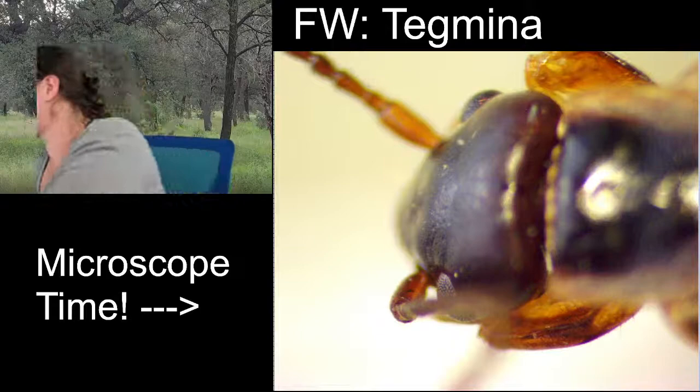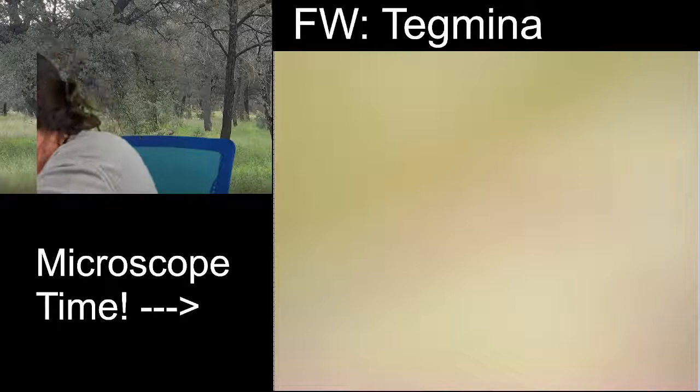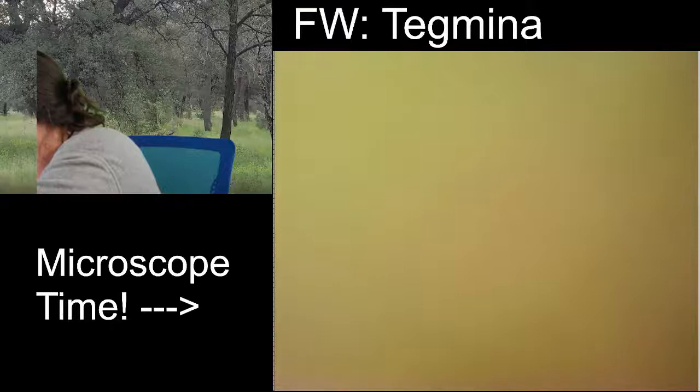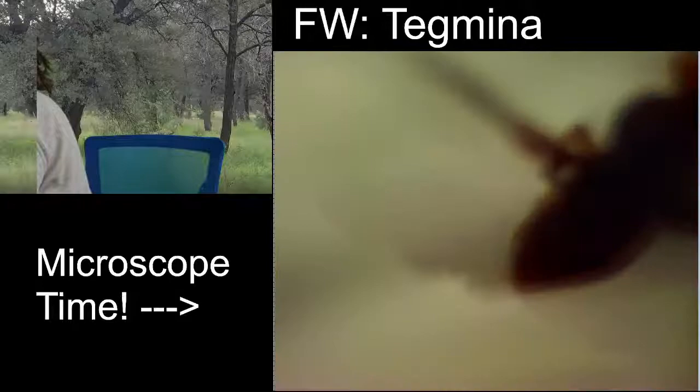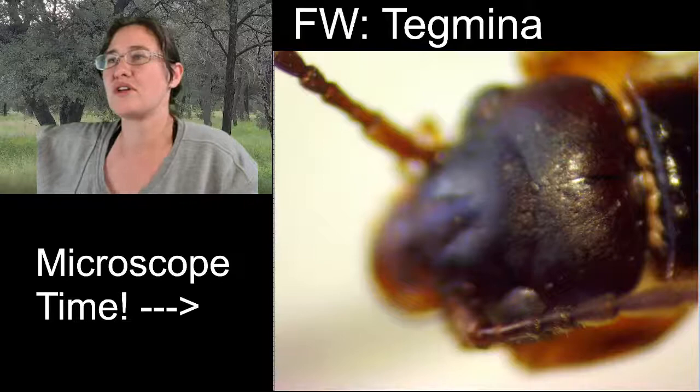Turn our earwig, or angle our earwig just a little bit so that we can see the head flat, because this specimen did angle its head down. And I want to get the full view. There we go.